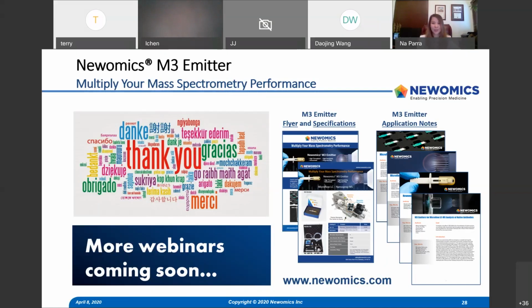So we're moving on to the next. Yes, I'd like to add something to this comment. Thank you so much for the comment. It's a very good observation. The main reason why right now we have an angle is because we are running microflow. For nanospray sources, typically they use a straight direct 90 degrees in or 0 degrees in without any angle because the droplet will go inside.